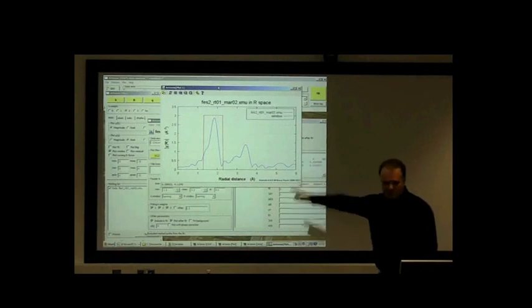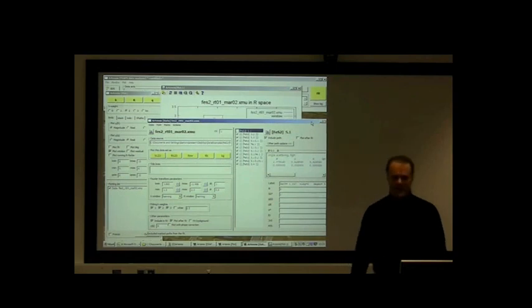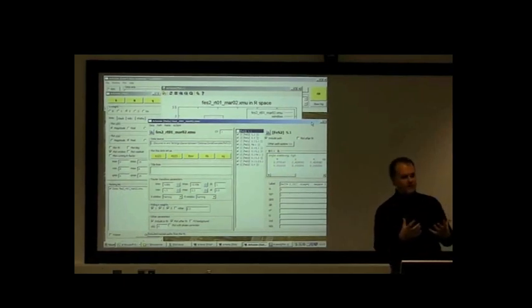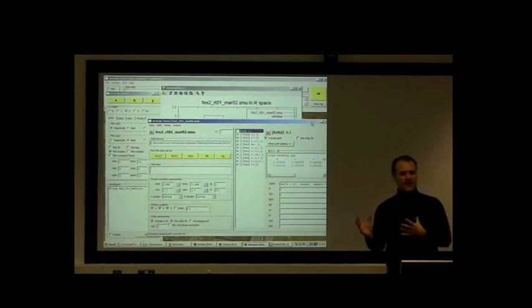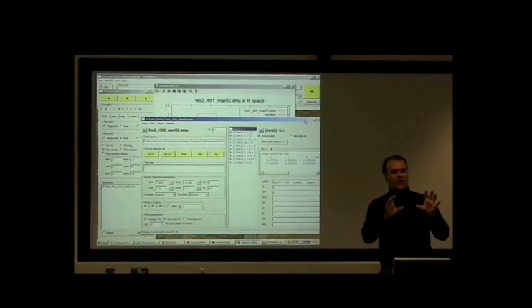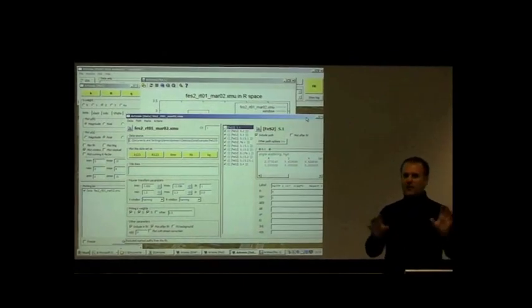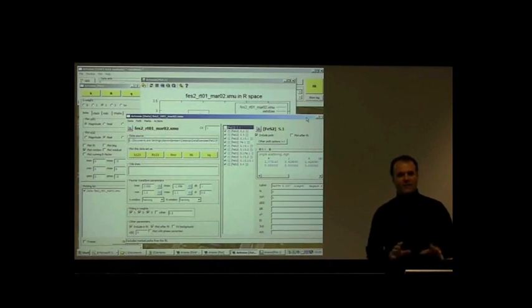The way the program works is like this. And for those of you coming to this for the first time, what I'm about to show you is going to seem slightly crazy and vastly overcomplicated. You're going to have to bear with me. The reason for doing what I'm about to do is not going to become clear until after lunch. So for now, you're going to have to just sit there and think, wow, that's crazy. Why is it done that way? And shrug and keep up with me. This is how it works.